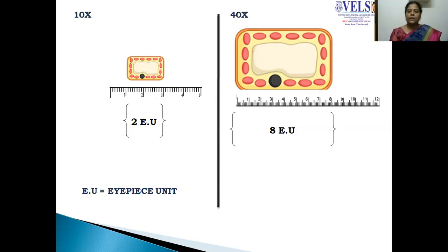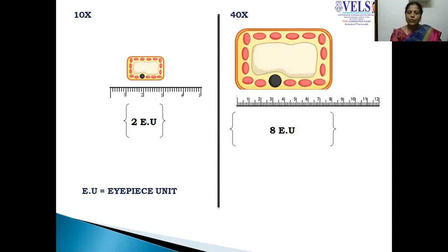Now I am switching the lens to high power, that is 40x, and measuring the size of the same object. Now it shows 8 IPS micrometer units, which means the size of the object has not physically enlarged or changed. Only we are switching the IPS micrometer from low power to high power. This shows that the ocular measurement corresponds to the length of the object, which depends on the objective lens being used.